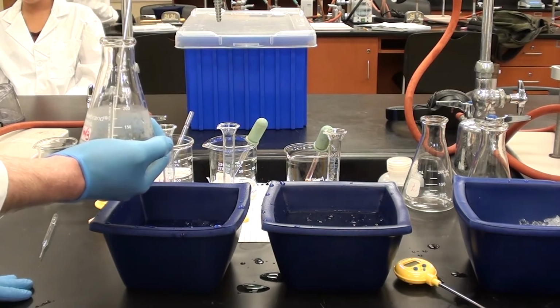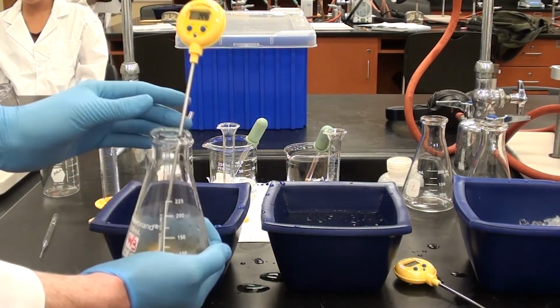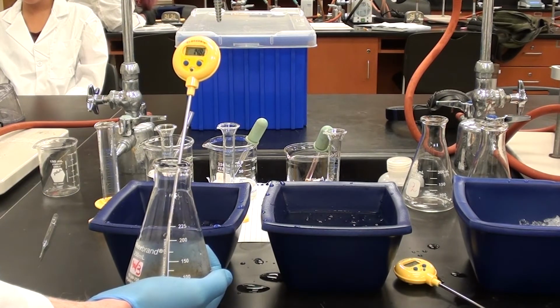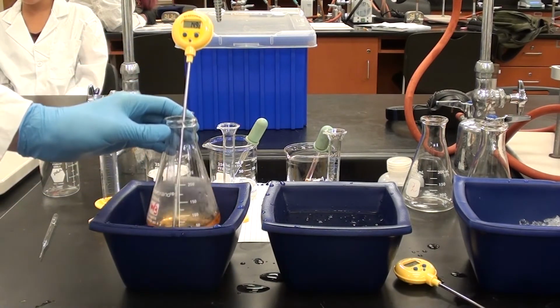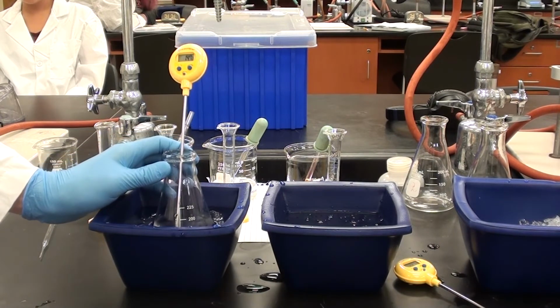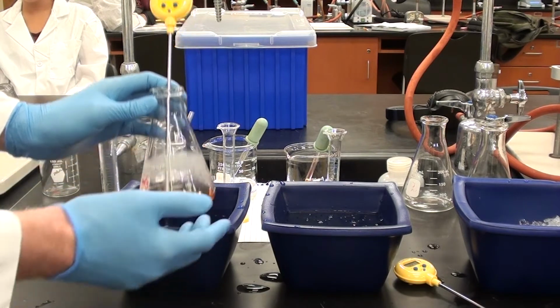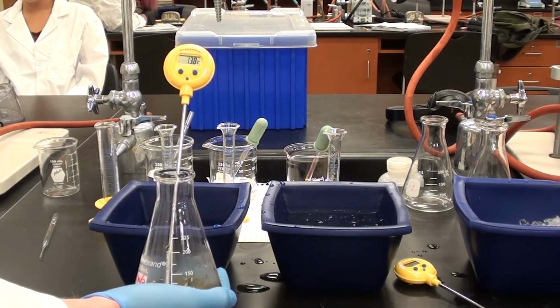So if you could please bring that down further so that the thermometer can be in the shot. There we go, that's good. Now you can see that the temperature's going up again. So go ahead and take it out and put it back in the ice bath. We're just trying to keep it at around 14.5. So now it's going down again. So take it out, put your hand around it, and just try and keep it at around 14.5.